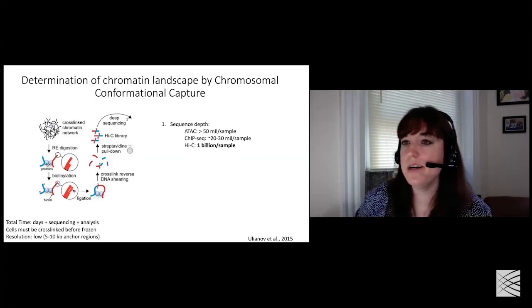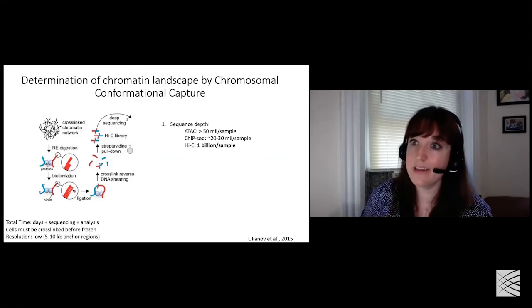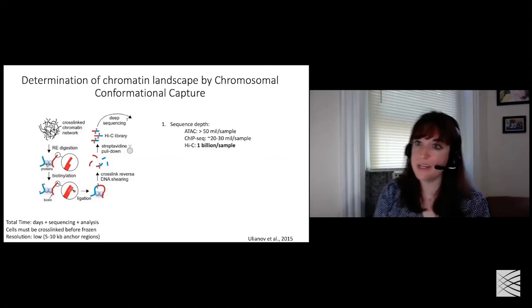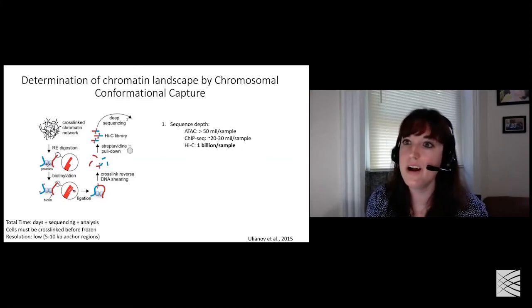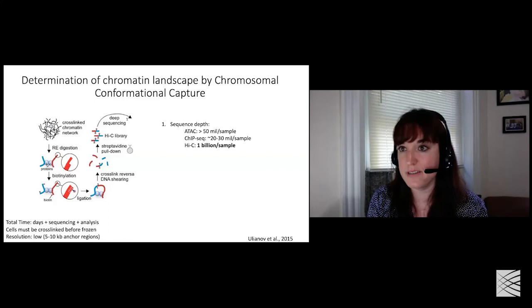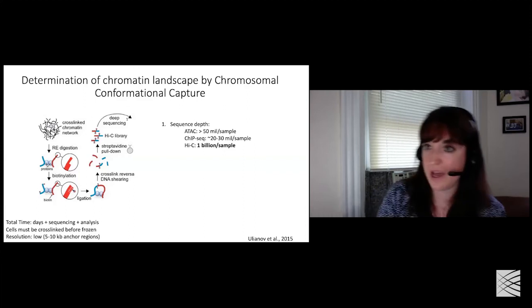Yeah. So generally, it really depends on your ChIP-seq antibody, right? Because it depends on the biology. I'm going to give an example later of where the ChIP-seq and the ATAC-seq actually don't overlap very well, but the RNA-seq data kind of explained why biologically the ChIP-seq and the ATAC-seq data don't overlap.